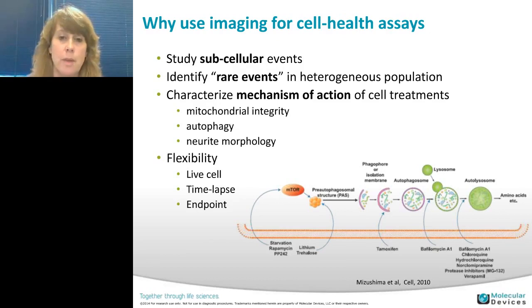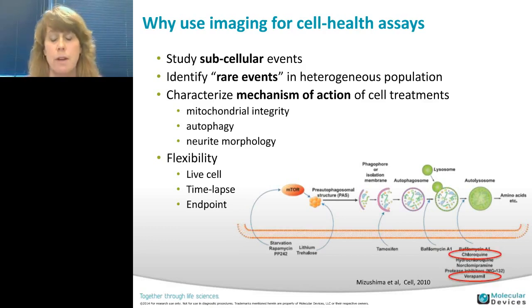Autophagy can be interrupted or stimulated at the beginning, or at the area where the autophagosomes are fusing with the lysosomes. And later I will show you some experiments, and some of the compounds we used for modifying autophagy were chloroquine and verapamil.